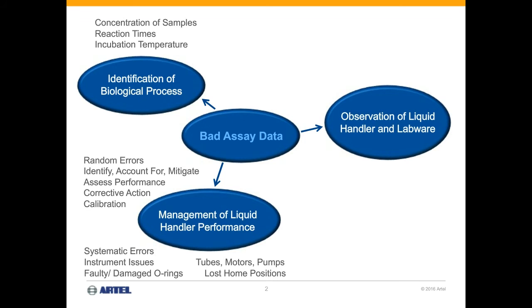You can look for things like numbering on it. Is it raised or just printed on there? Any other little things, like the plastic looks a little different or something, and you may have to redefine that piece of labware if you're using a third-party branded labware.